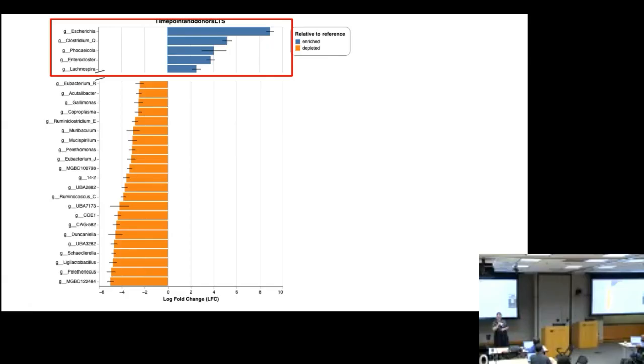In terms of how many 16S amplicons I see, we tend to not use raw sequence numbers as a way to count, because 16S amplicons are PCR'd, and sometimes that amplification isn't necessarily representative of high diversity. It's just representative of the tools we're using.